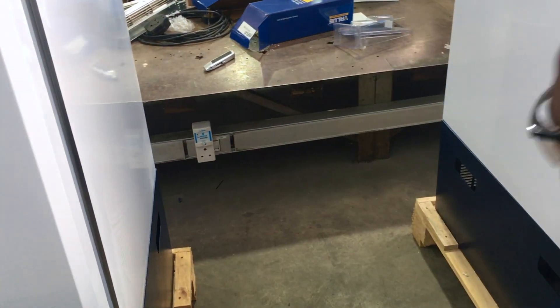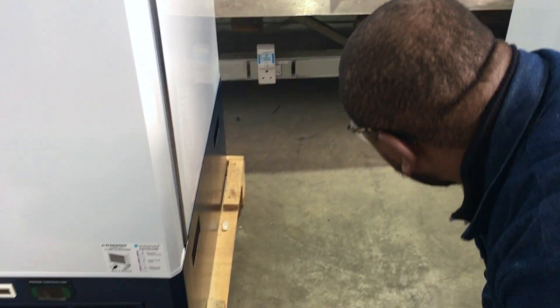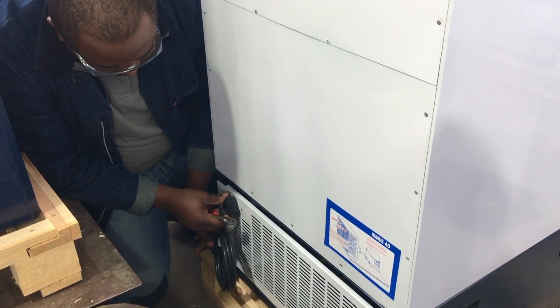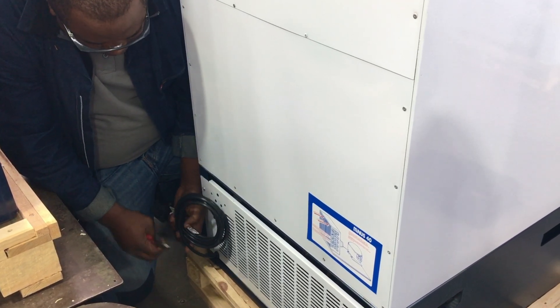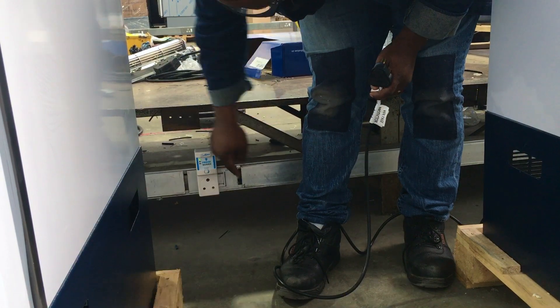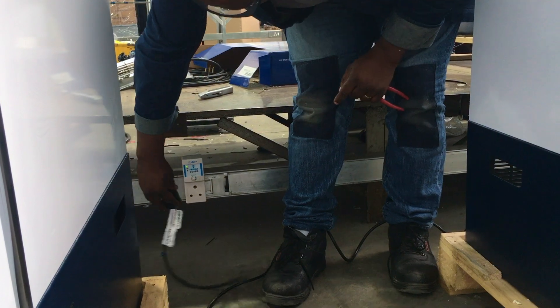Use your tools — a side cutter — and go to the back of the fridge where you have the power supply cable. Take the power supply cord and remove all the cable tabs. Monitor your voltage guard, and as soon as you see the green light, it is safe to plug in your fridge.